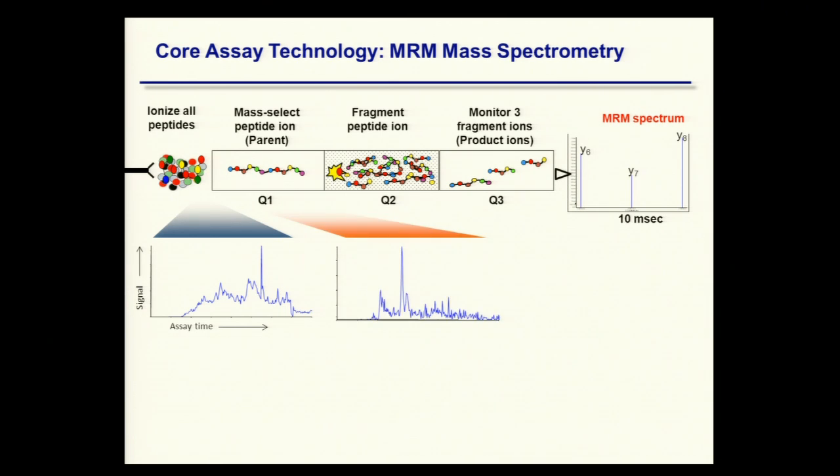So if you apply a first level of filtering in the mass spectrometer, where you just select to look at certain, either one or a number of precursors or parent ions or peptides, you will get simplified signals, so a simplified spectrum or chromatogram. But again, there's a lot of noise. When you apply the second level of filtering, this is where you will select specific fragment ions coming from a specific precursor of your interest. You will see a signal like this, much, much cleaner.